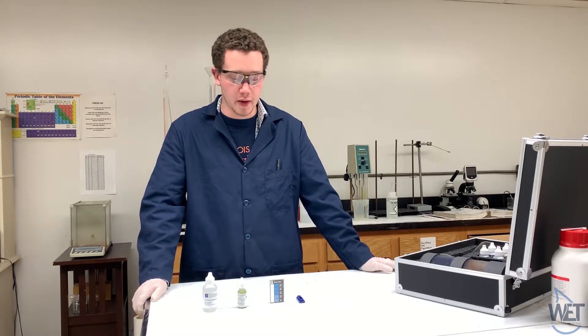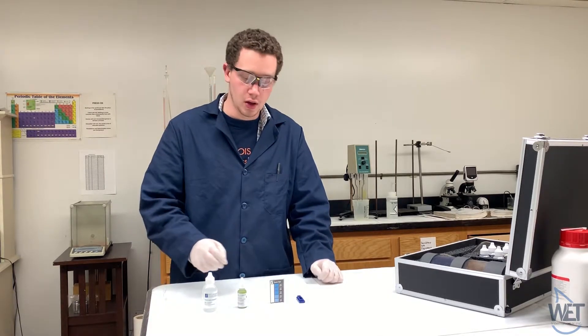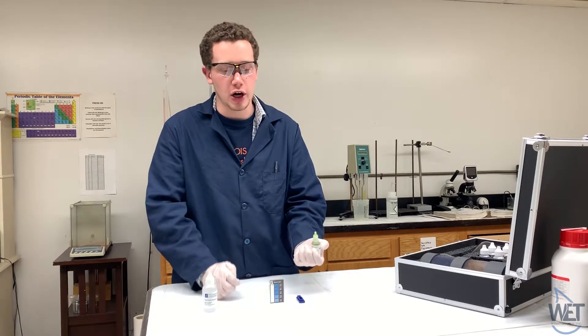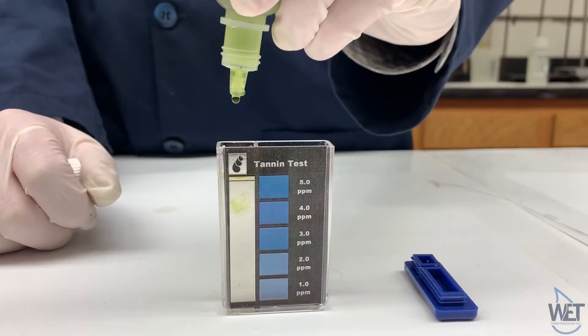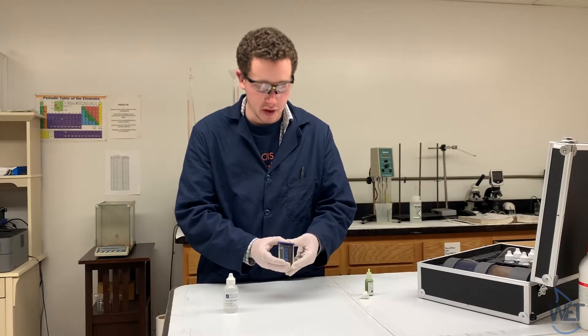For the tannin test, you'll want to fill the color comparator up to the line with the sample to be tested. Then take tannin-lignin reagent number one and add about two drops of it. Go ahead and cap and mix that.